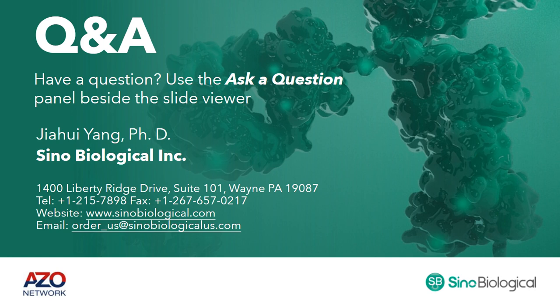Thanks for the question. We have used DNA as immunogen for antibody discovery in-house. Several antibodies are developed by DNA immunization, such as CD34, as shown in the presentation. The biggest challenge of DNA immunization is the immune response. So what we do is modify the expression vectors to include a couple of components to help increase the immune response. This will help to improve the expression of the target gene in the immunized animals. The expression DNA sequences have also been codon optimized to improve expression.